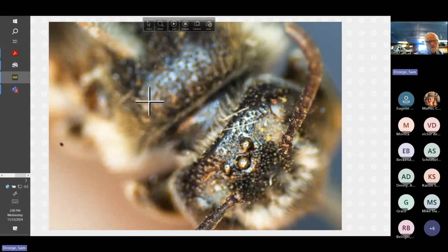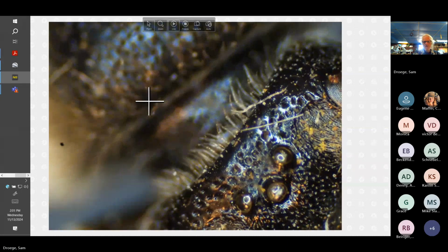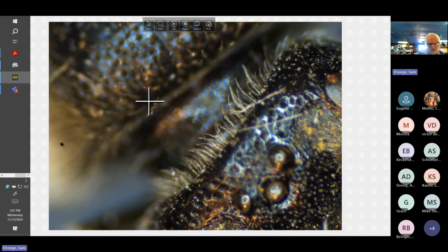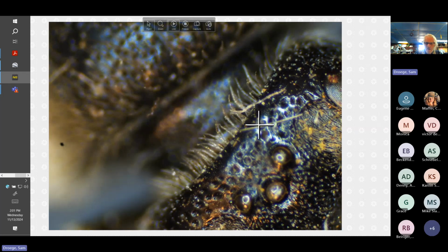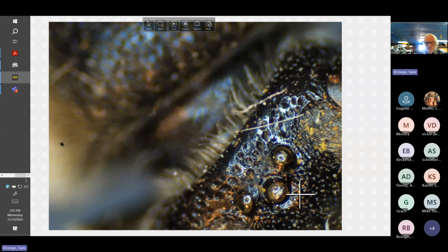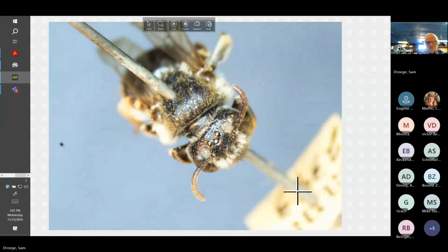All right. Here we have, oh my gosh, I would say there's 3 rows there. All right, it's a little bit difficult. This is definitely 1, 2, and maybe 3 of baby ones. They're trying to. Yeah. So I don't know. I don't know on that one. We're going to look at the propodial triangle now.